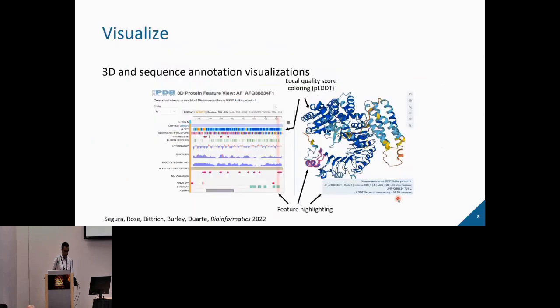You can visualize, and I want to show this example of the sequence annotation viewer and Mol* viewer that we offer as a single interactive application. Maybe just, well, we are in the visualization session. We've heard a lot about it at ISMB. Mol* was originally created by a collaboration between the RCSB PDB at UCSD and the PDB Europe and David Sehnal at the Central European Institute of Technology in Czech Republic.